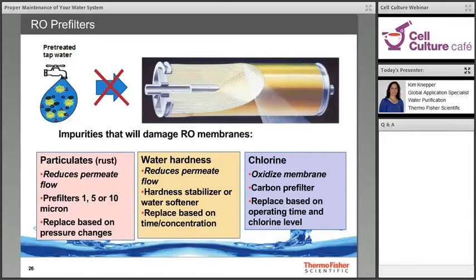But also note, in some labs that have a water supply from a surface source, you may have experienced elevated organics during certain times of the year, like the spring or the fall, so that may affect your carbon cartridges.